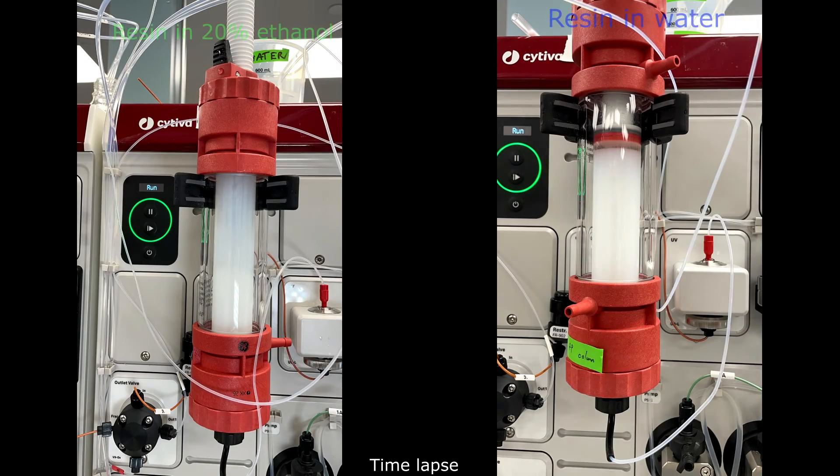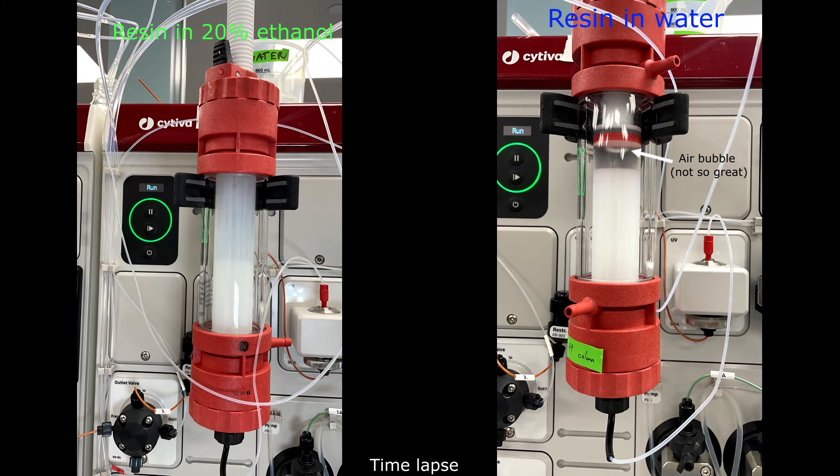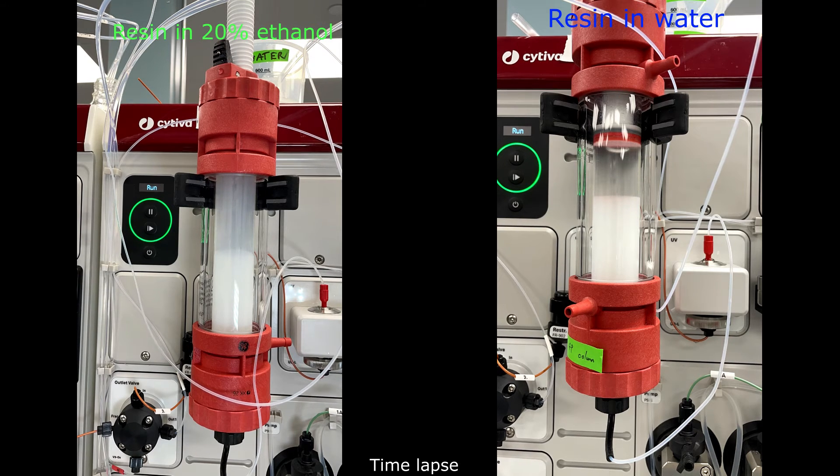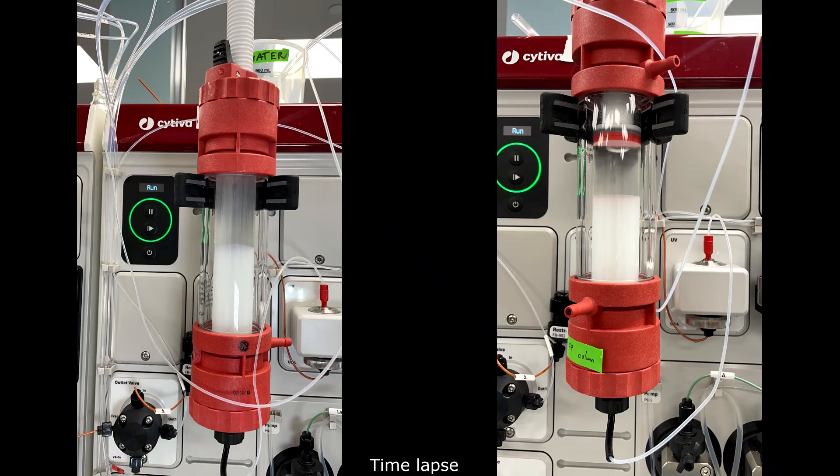So I did this pack several times for this video. What I want you to see is that this is a time-lapse video for packing the column when the resin has a bunch of ethanol in it, that's on the left, and when it's completely equilibrated in water on the right. You'll notice that the resin settles almost immediately if it's completely in water.